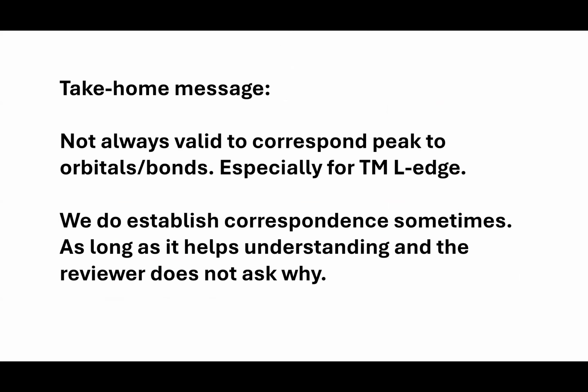Okay, maybe I can summarize what I have lectured so far. To understand the XAS process, we need to understand the electronic structure of our materials. We have different levels, but we need to appreciate that, strictly speaking, the physics of XAS involves excited states.